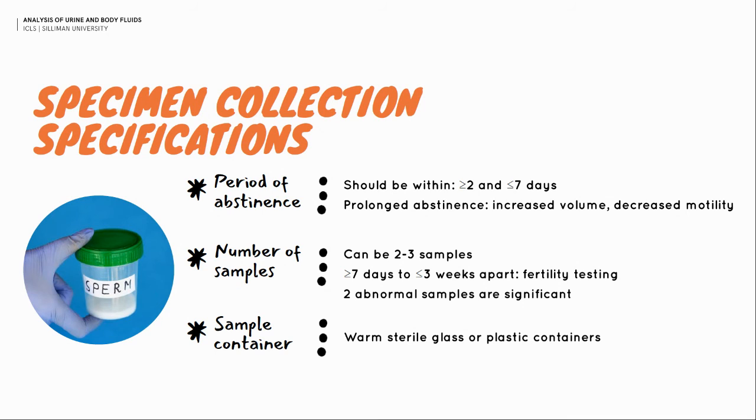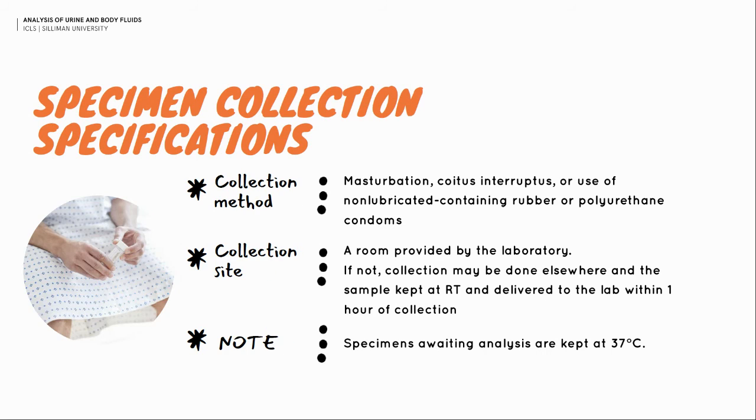So that is for the specimen collection specifications, or our criteria for collecting seminal fluid.